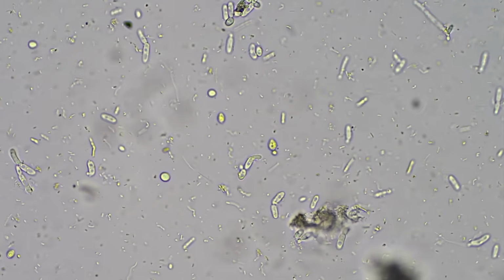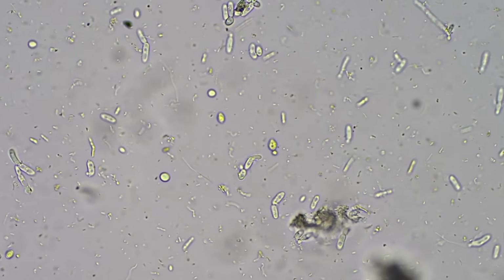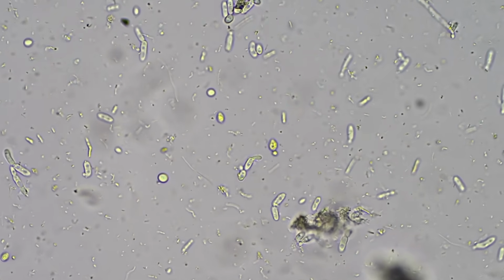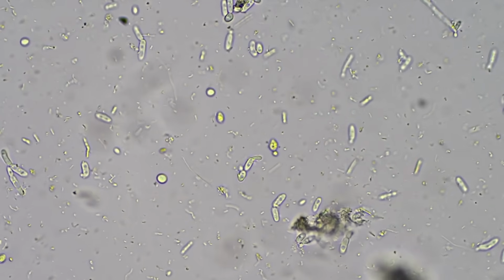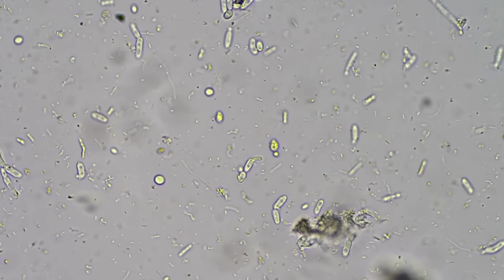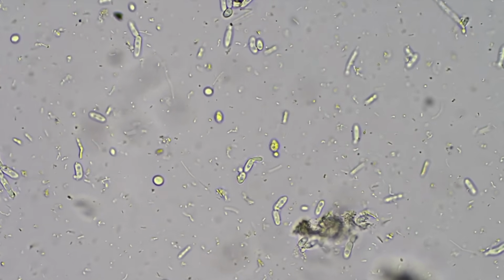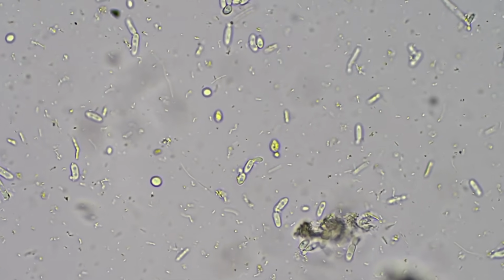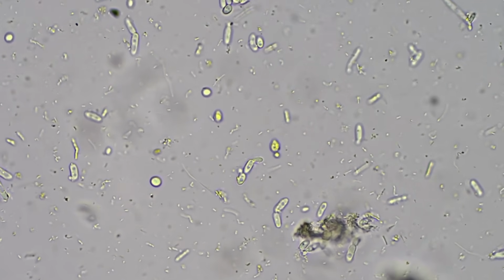We've got rods, lactobacillus. We've got small, tiny rods. We've got big rods. We've got long lactobacilli, and lactobacilli waving and bending slightly sometimes. So you've got to be careful not to get it confused with actinobacteria, where it's branching and more squiggly. But look how active this is.